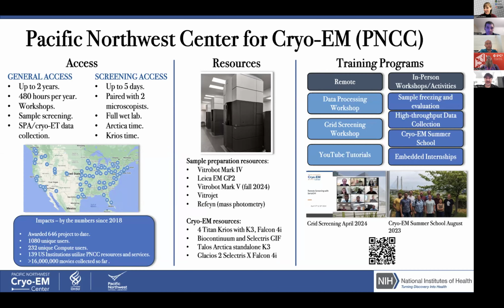Thanks, Christina. I am Omar Devolku, one of the microscopists here at the Pacific Northwest Center in beautiful and sunny Portland, Oregon. Just like all of the other centers, we offer our users a seamless workflow from sample prep all the way to 3D reconstruction, including our screening access mechanism in which users fly out for a week and work with staff here hand in hand to go from a sample in an epitube to a reconstruction.